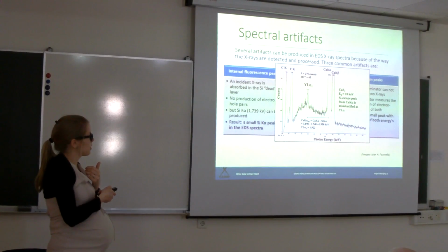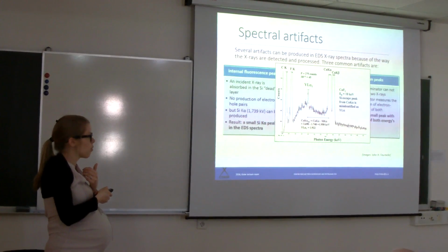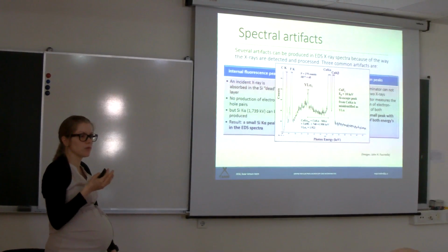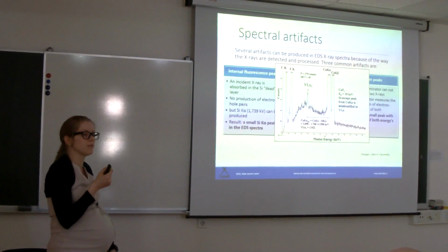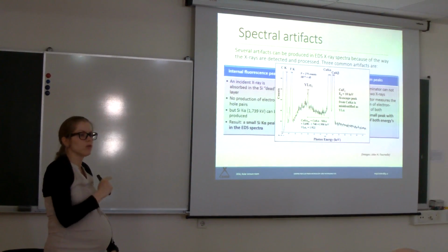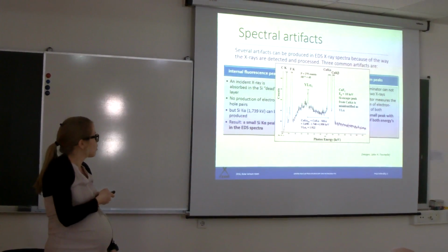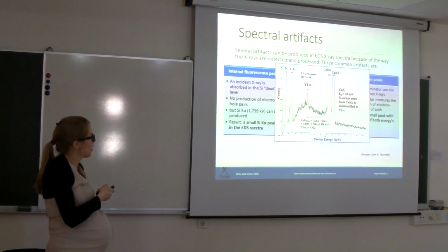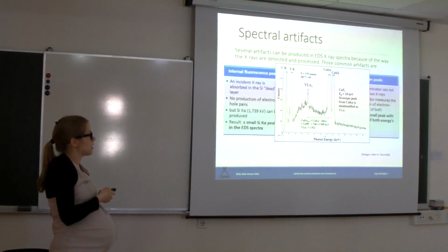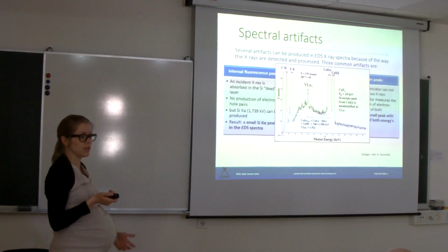and this is shown here, but it's small, and in the new programs you have options that reconstruct and remove those problems. Yeah, so you can see this is the shift by a small amount, and if you don't know what you're doing, you could say this is another element, but it's actually not.